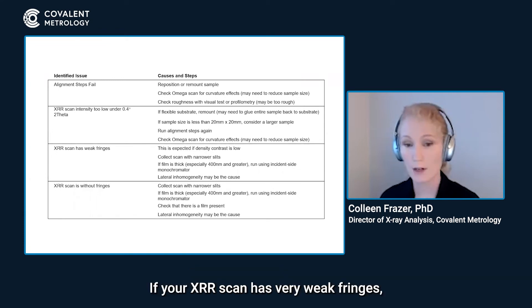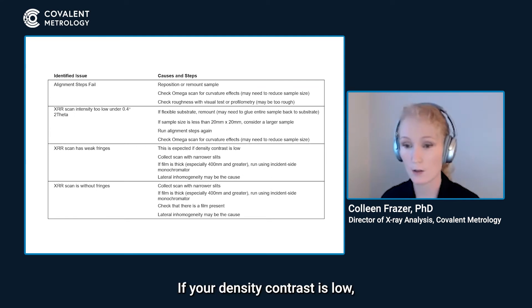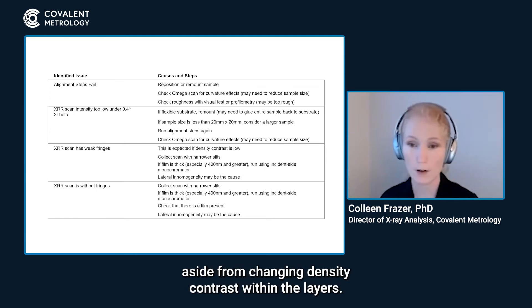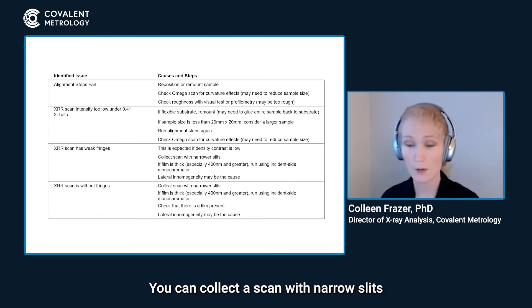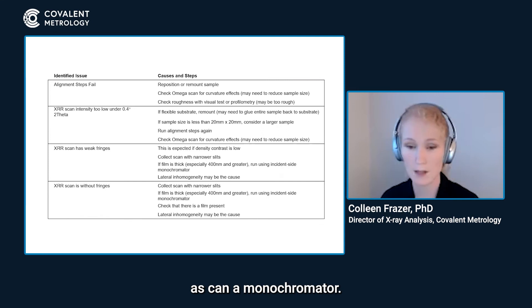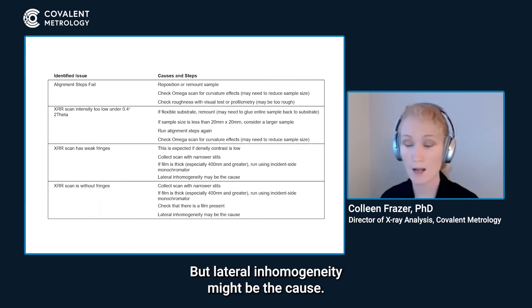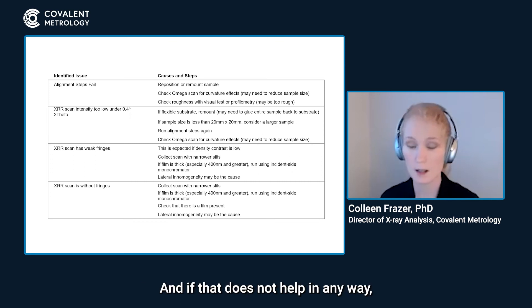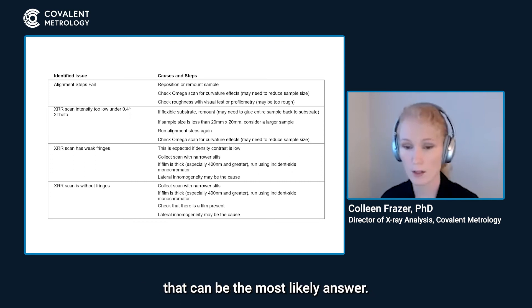If your XR scan has very weak fringes, this might be expected. If your density contrast is low, you might not be able to do anything about it aside from changing density contrast within the layers. You can collect a scan with narrow slits, which can help the resolution of your system, as can a monochrometer. Lateral inhomogeneity might also be the cause — try making a smaller beam, and if that does not help, that can be the most likely answer.